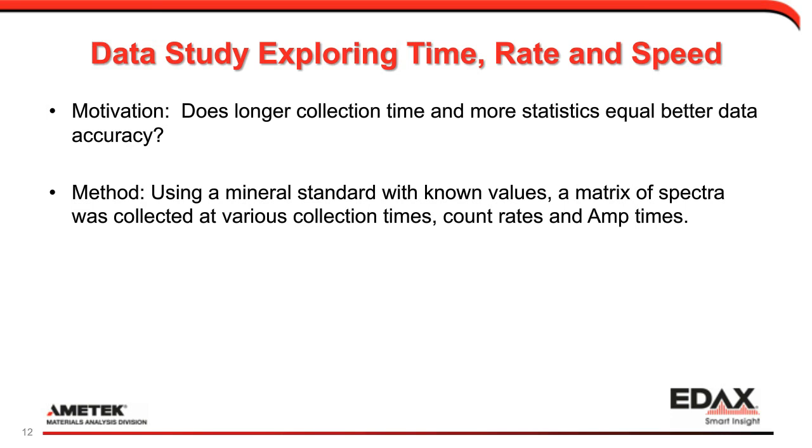I would like to start off with just a little bit of a conversation about why we work in some of the conditions that we do. Things like working at 20 to 40% dead time. It's a little bit of a traditional perspective. It is a matter of setting a rule of thumb and working at that set condition over and over again. But I'm going to question that assumption now, and rather than say working at the 20 to 40% dead time, which was the traditional answer, I'm going to say let's explore different data studies that allow us to better understand the process times and the performance, and see how the data may update our approach to dead time.